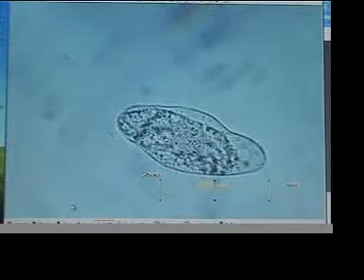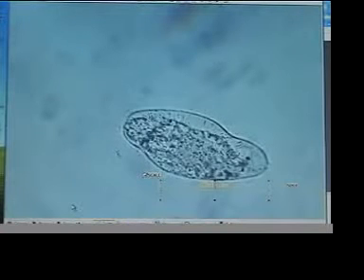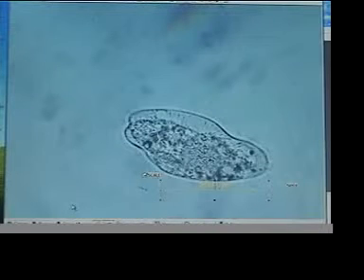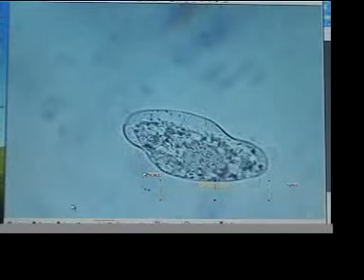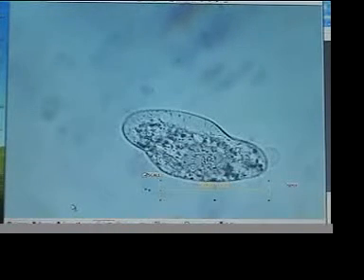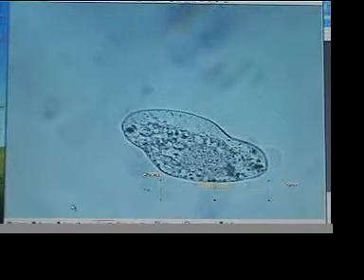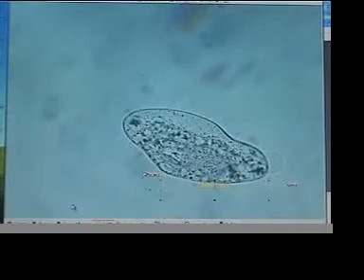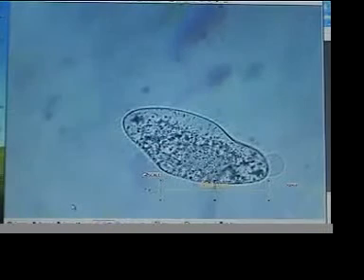You're watching a destruction of a paramecium in real time. Now you see there's been an internal destruction. You can see that the normal internal structures have been distorted. And now you're seeing blisters coming out on the organism and complete change. We're watching this through what's known as a DIC filter on the microscope.